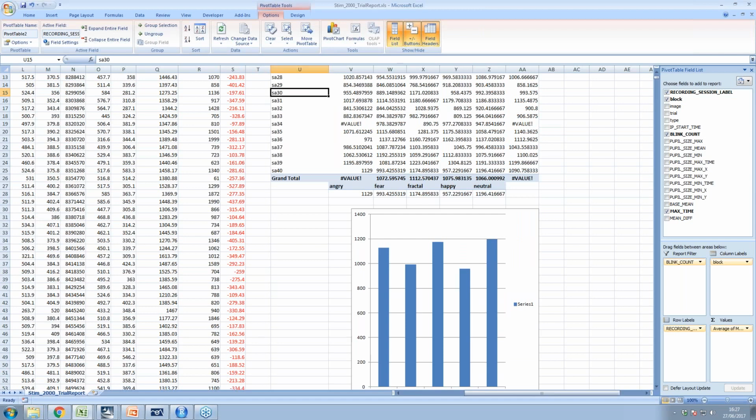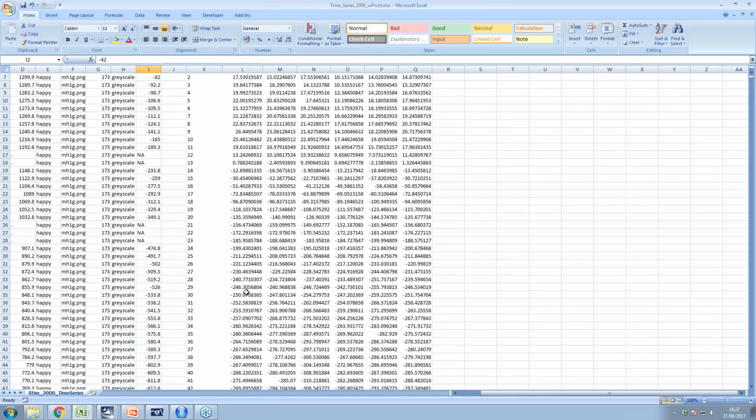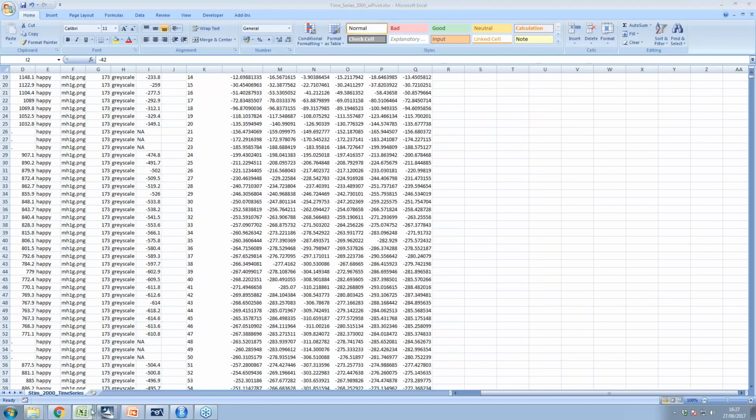So the next thing I want to show you in the data is how we actually look at pupil change over time. This is one very, very quick and simple technique to look at various things, to see whether there's any kind of obvious effect on maximum pupil size during the window of interest minus the baseline average pupil size during the baseline period.